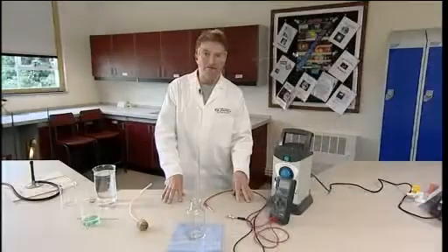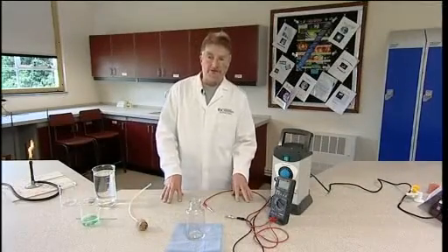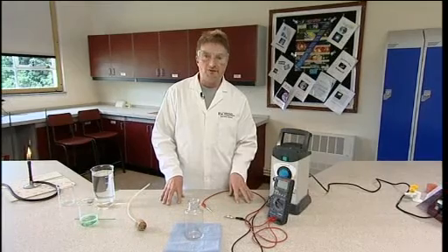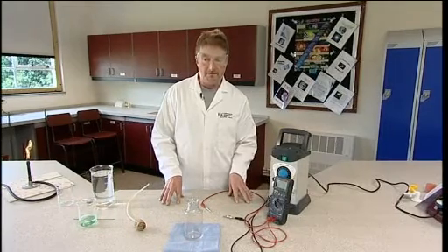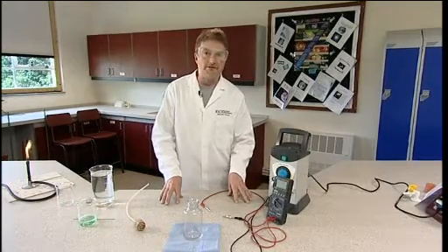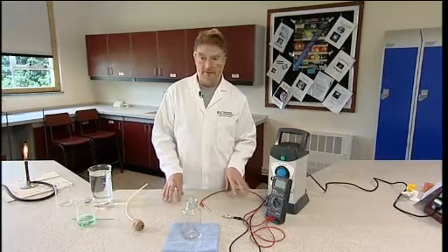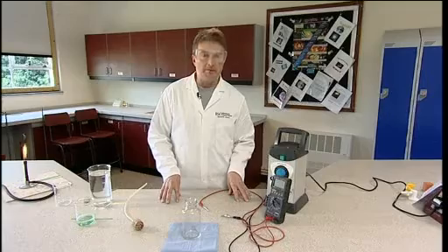This experiment is about the electrolysis of water, which will give us a mixture of hydrogen and oxygen gases in a 2 to 1 ratio by volume. Because they're in just the right ratio to react — the stoichiometric ratio — if we ignite them, a really quite small quantity of them will give a pretty impressive pop.